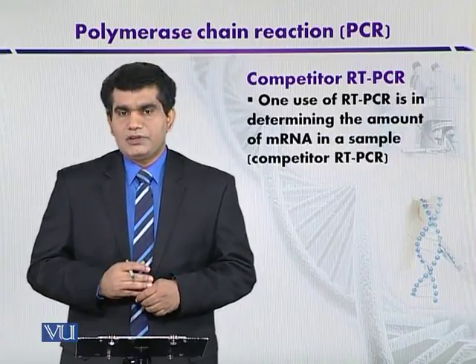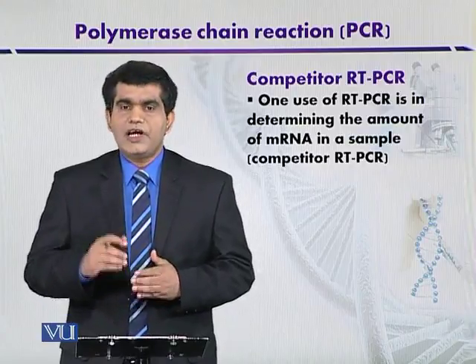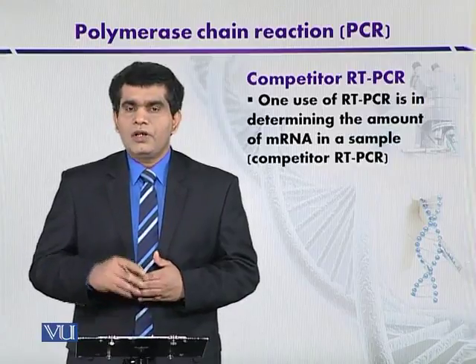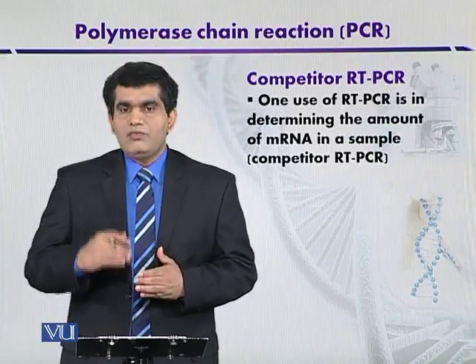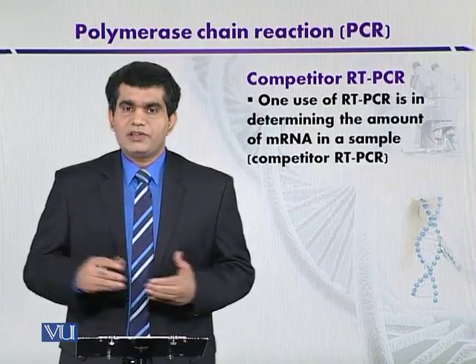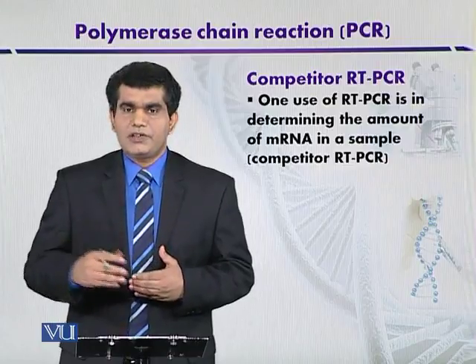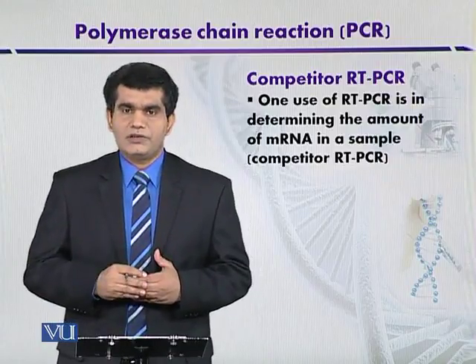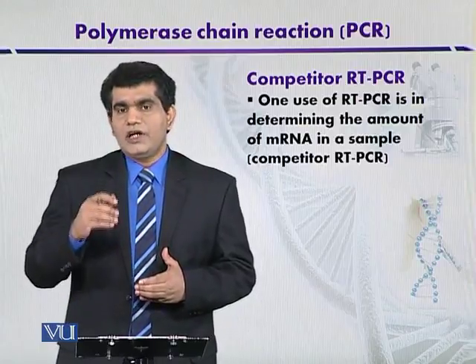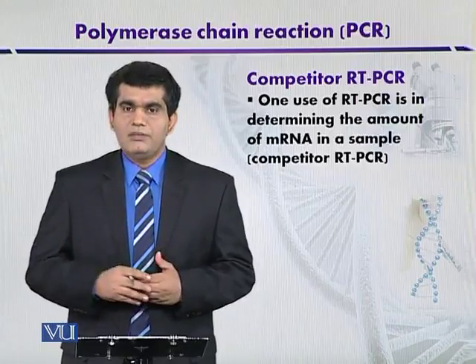One of the applications of competitor RNA is that it can be used in diagnostic procedures. That is, when we are going to detect certain pathogens, that may be viruses, like the viruses of hepatitis or other retroviruses, whose nucleic acid is RNA. So for such diagnostic processes, we can use a competitor RT-PCR.